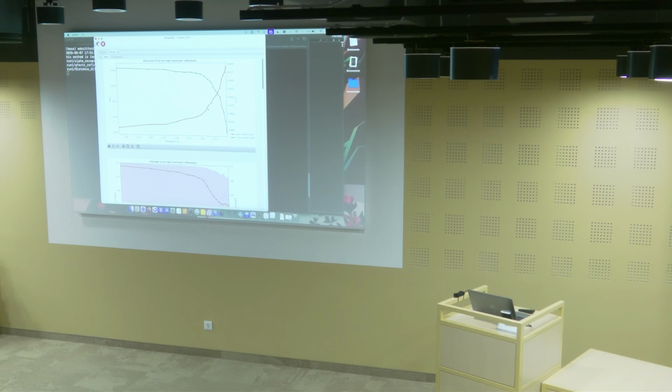If this really goes asymptotic, or becomes a curve that goes up and down, it means that from there on the data is not really trustworthy anymore, so it might be better to cut the data. In this case, we have an overall isomorphism of 10%, which is generally seen as good. At high resolution, we go to 25%. You could tolerate up to 30, 40, maybe 50, but then we already have very high residual factors.